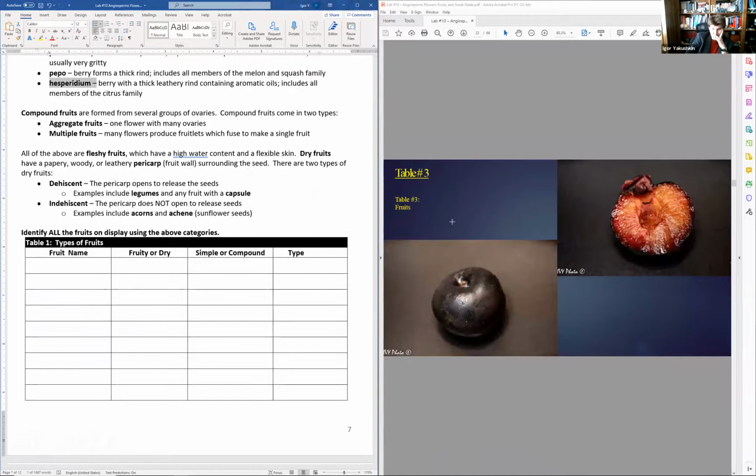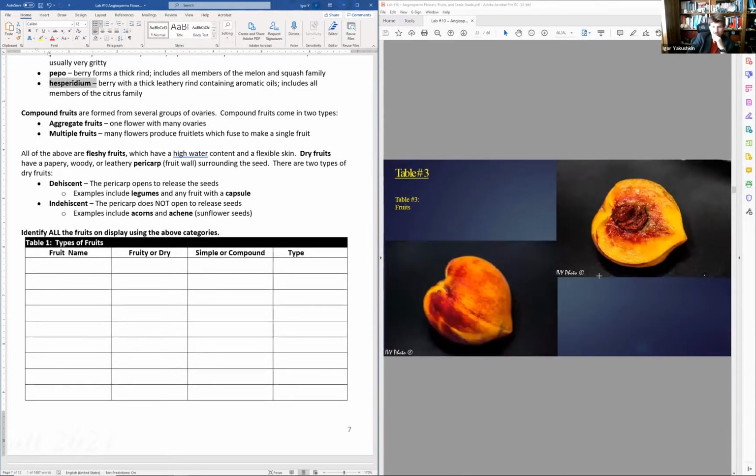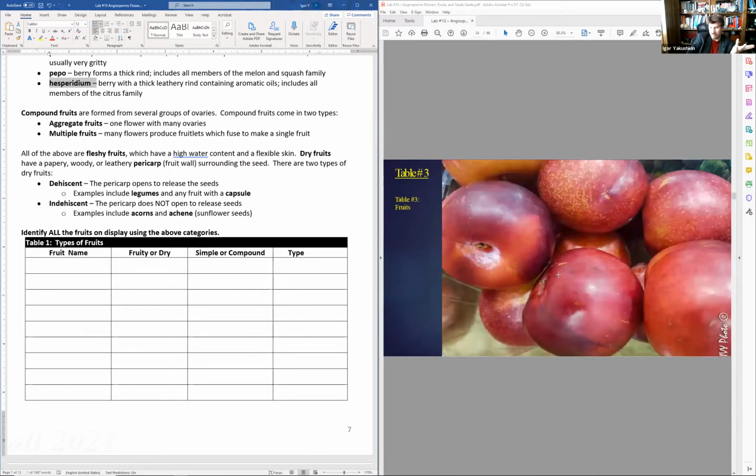All right. So next one, here we have a peach, not peach, plum. You can see one seed only. If it's one seed only, it's automatically simple. Fleshy, simple. Same thing here with the peach, one seed only, automatically simple, fleshy. And anybody know what that is? That's something known as the pluot. What is the pluot?